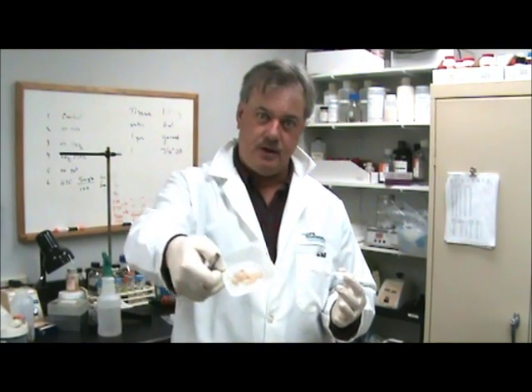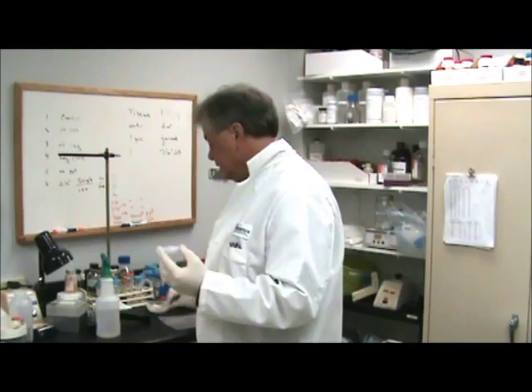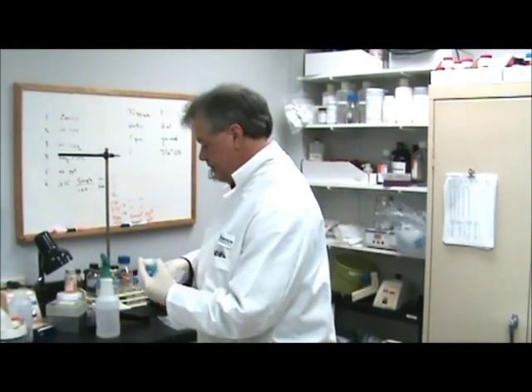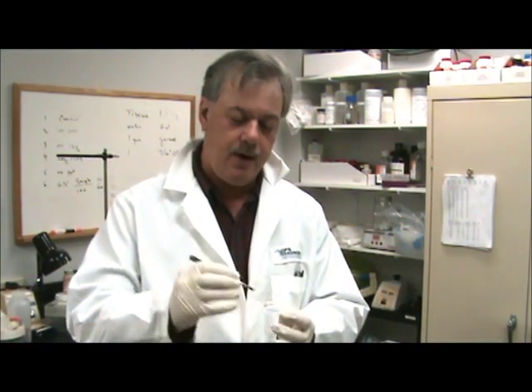Hello, I'm going to show you how to homogenize skin, in this case rat skin. I have a collection of pieces here taken from a much larger piece and we're going to be doing 30 milligrams in the Cryo Grinder — that's about that much right there.